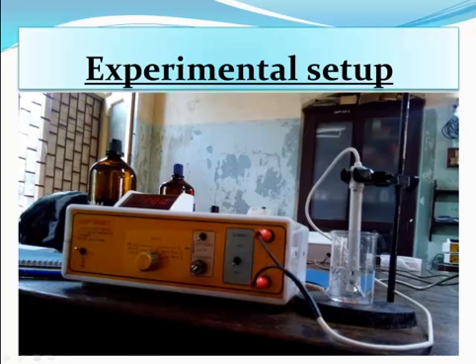So basically, if I am carrying out a titration of say HCl versus NaOH, this beaker will have a small amount of HCl which becomes the analyte. However, the electrodes of the probe may not dip in the HCl solution. And as a consequence, we will add a small amount of water in order to make sure that the electrodes are dipping in the solution.